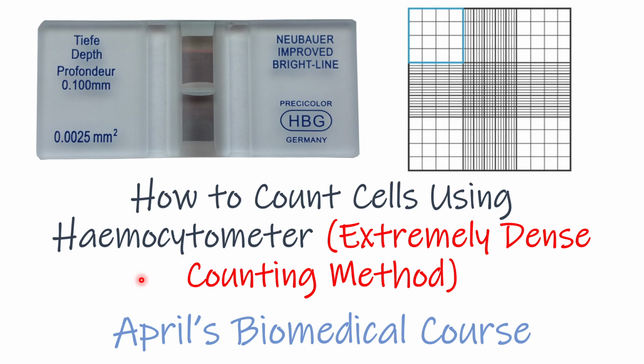And in that previous counting method, we either count all the cells within the big cells, so we count the whole cells within the whole grid, or we can count the cells within 5 big cells. Big cell number 1, number 3, number 5, number 7, and number 9. But we're not going to do that here. In the case of such extremely dense cell concentration, we will only count cells that are present or contained within the big cell number 5, which is this one in the middle.